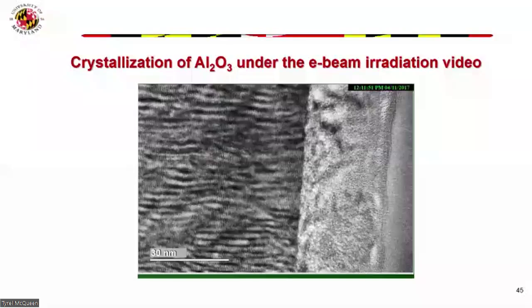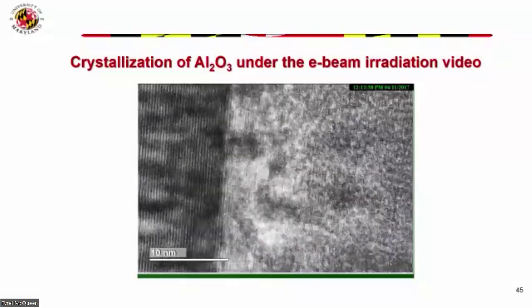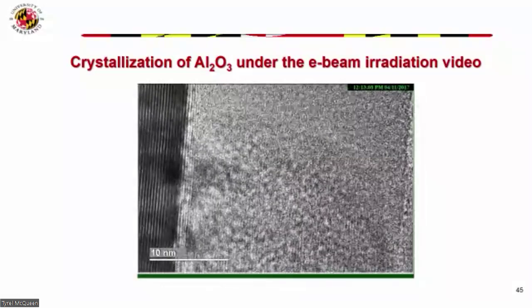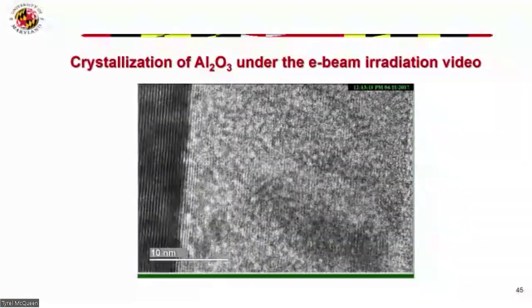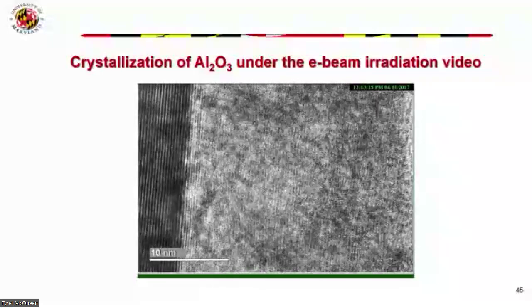Okay, and so we'll move very soon. So this is now at higher magnification. You can see now the scale change. So this is high resolution. And of course, the beam size is larger than the field of view. So hopefully you can see the profile moving here. And it will move again a little more.